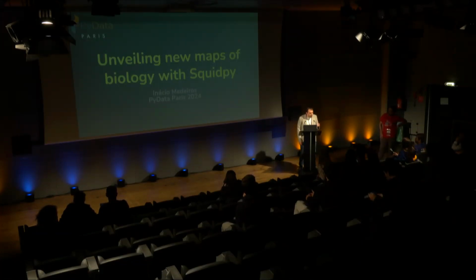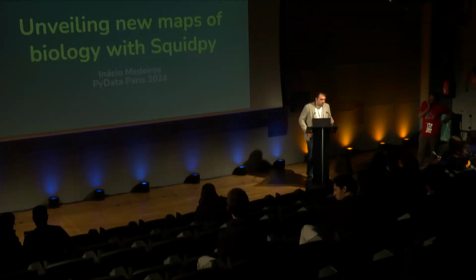For cell type deconvolution task, there are publicly available single cell data sets, which have the expression of genes related to each possible cell type for thousands of individual cells. So in a cell type deconvolution task, you train a model with single cell data and use this model to predict the proportions of cell types in spatial transcriptomics data. So it's a supervised task.